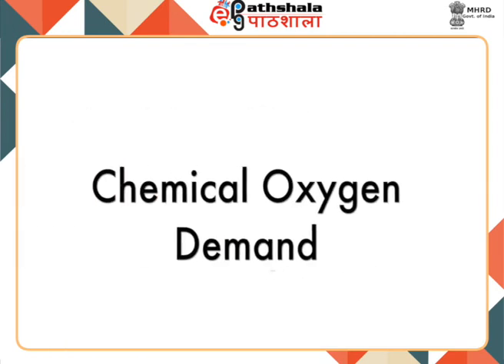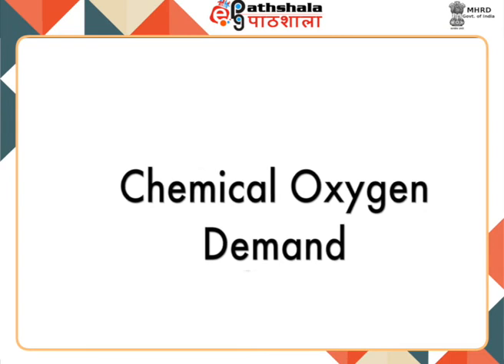The next parameter is chemical oxygen demand. BOD does not give accurate results of pollution load because non-biodegradable wastes like pesticides and detergents are resistant to microbial degradation and hence do not affect BOD.